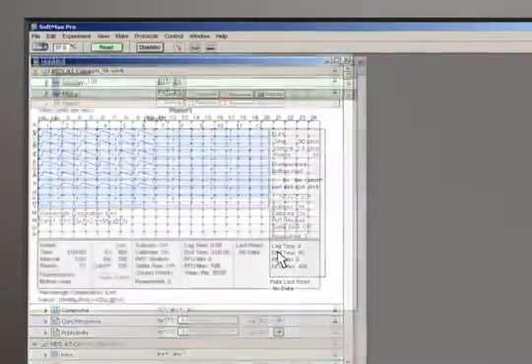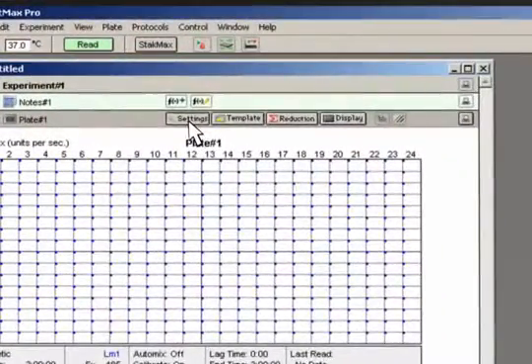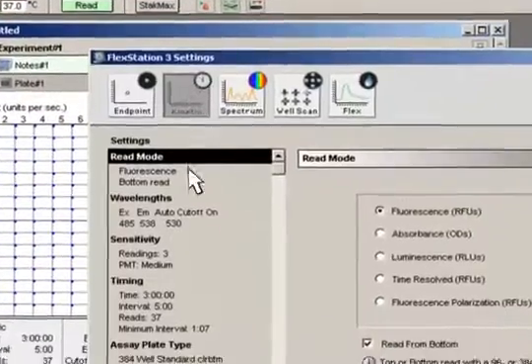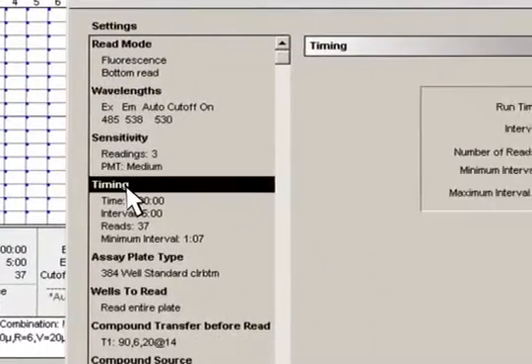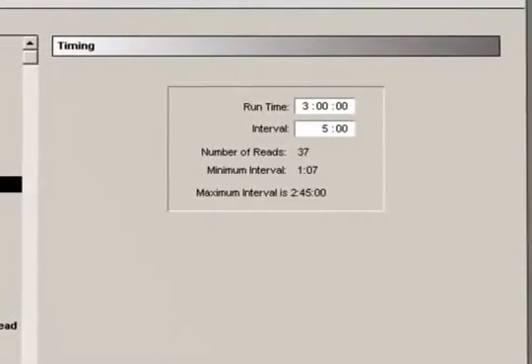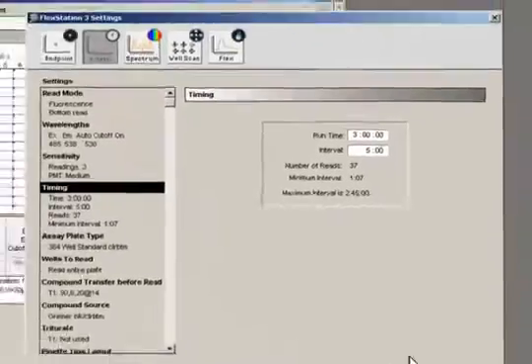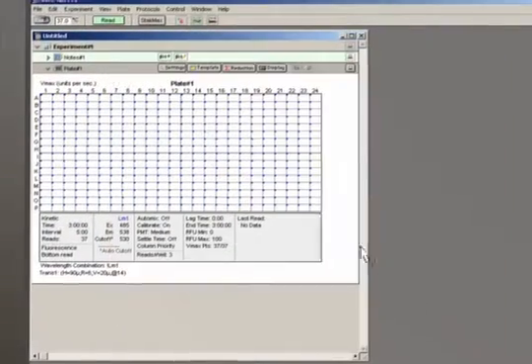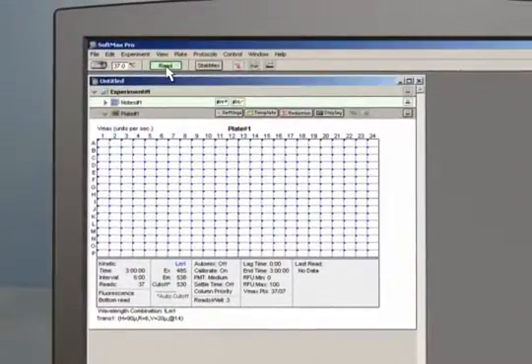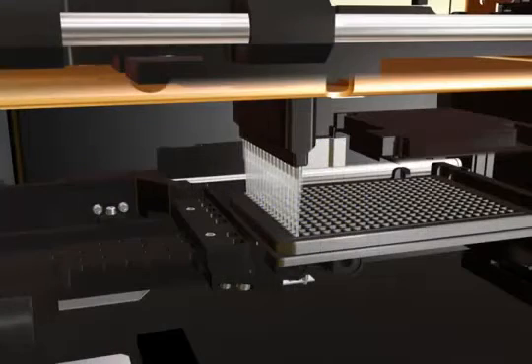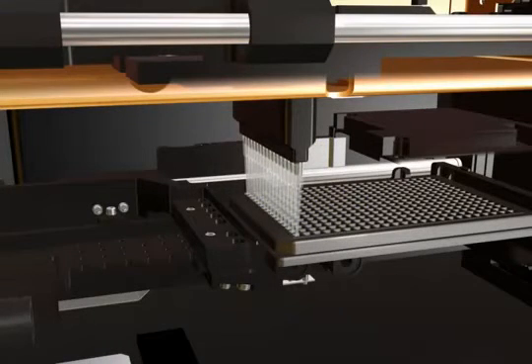You can also set up longer kinetic reads with an initial fluid transfer step. Here we have selected a total runtime of 3 hours, with the plate being read every 5 minutes. Automated pipetting ensures consistent addition times and minimizes pipetting errors.